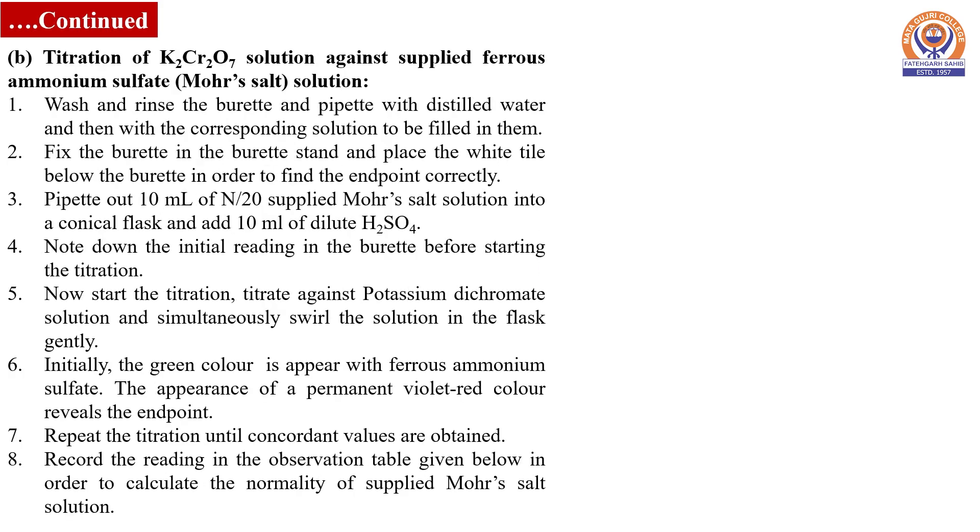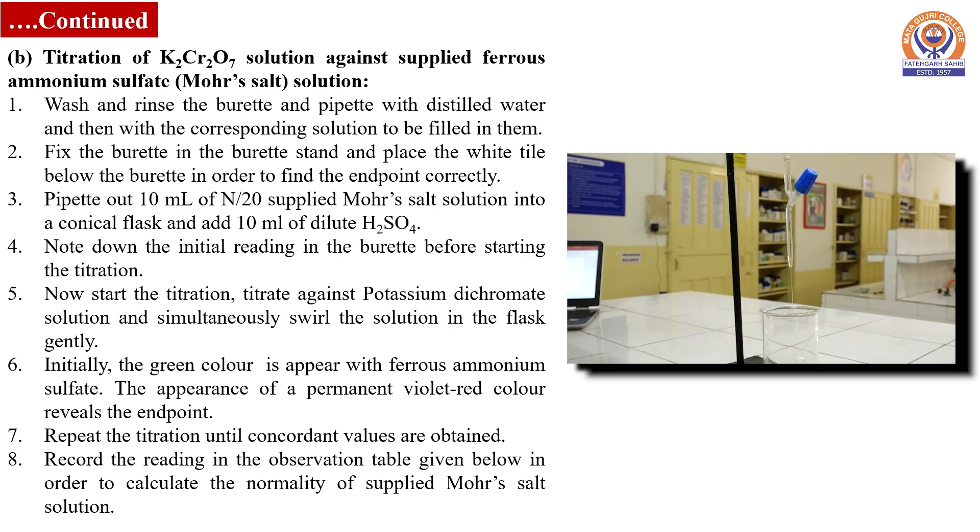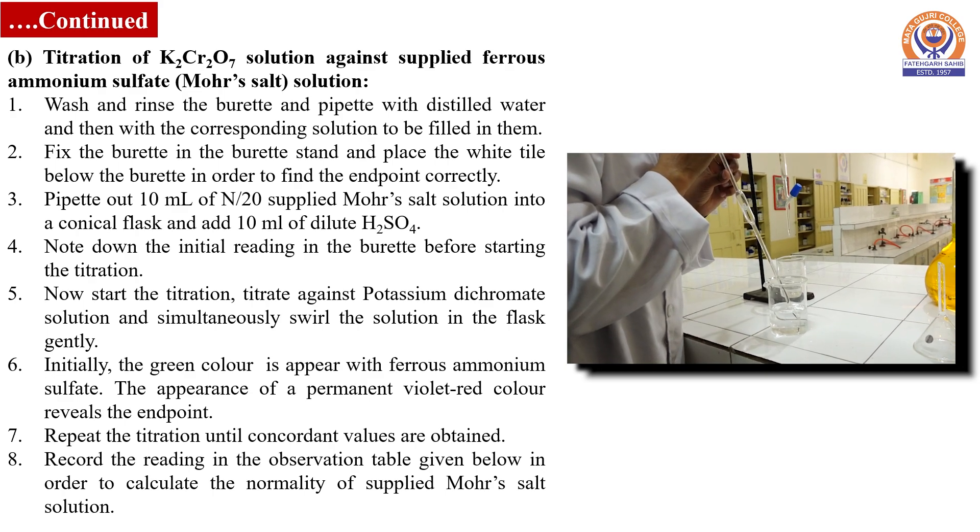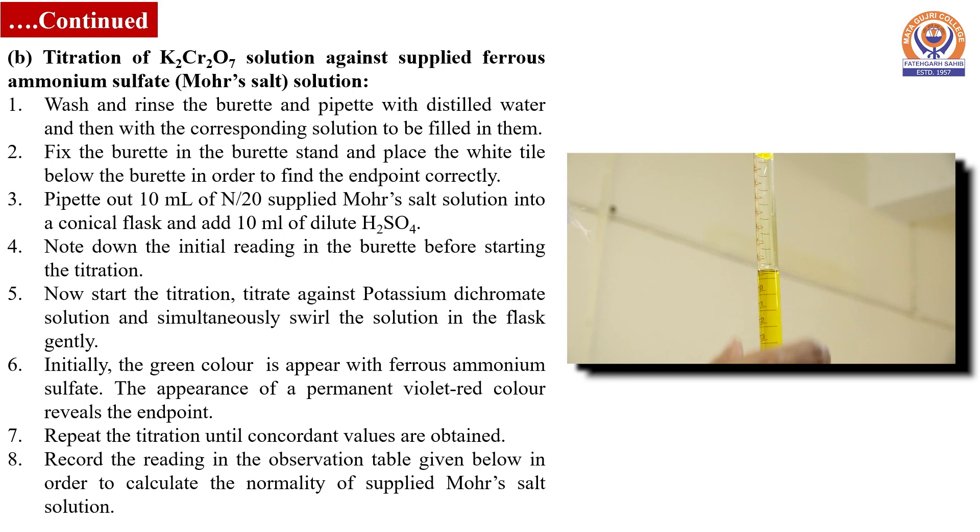The second part is the titration of standard solution of potassium dichromate against the supplied ferrous ammonium sulfate solution. Wash and rinse the burette and pipette first with distilled water and then with the corresponding solutions to be filled in them.